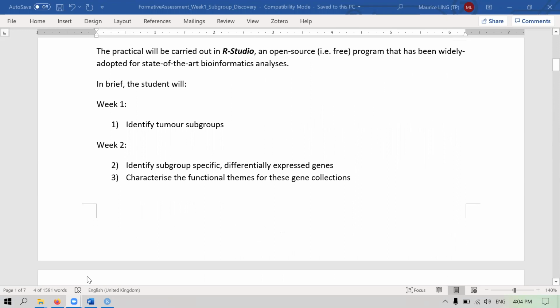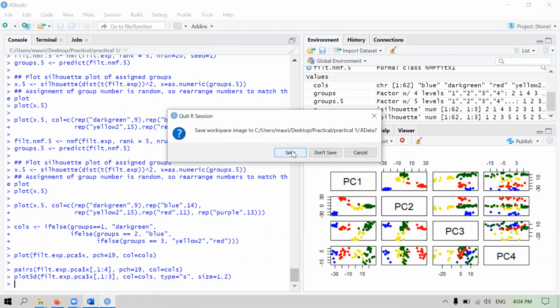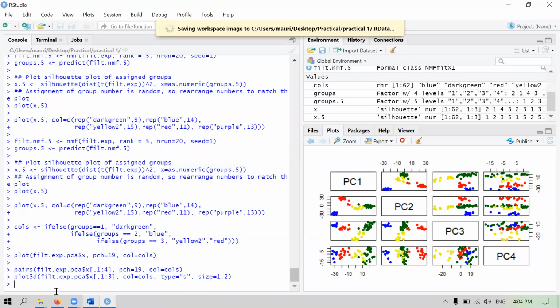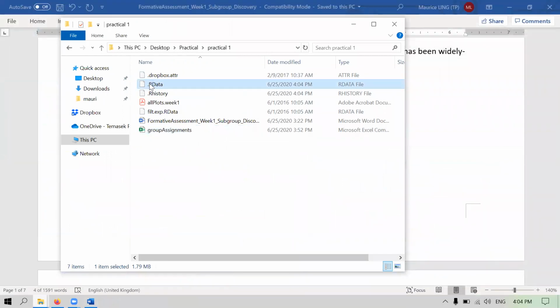As for now, we can log out. As we log out, for example when we close this, please always try to save your data. Save the workspace. Now the workspace is being saved as your R data. Rather than calling it R data, let's call this end of day 1. We'll need this for the subsequent days because we want to bring back all the data again. All right, that's all for today.